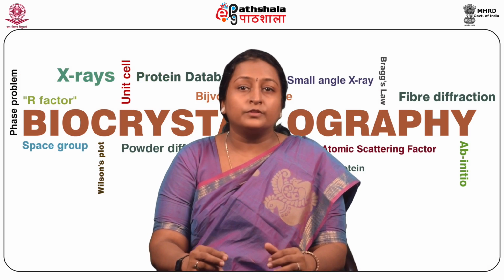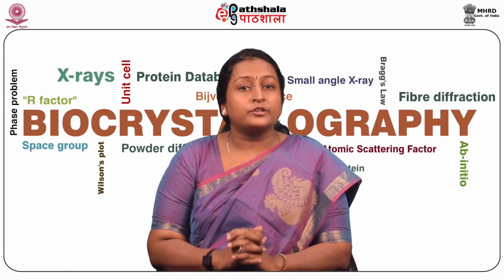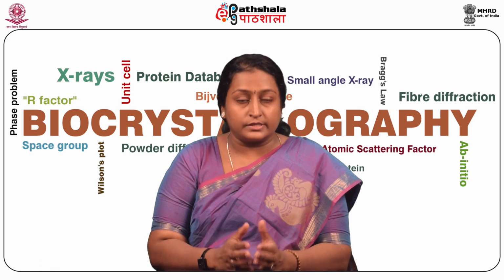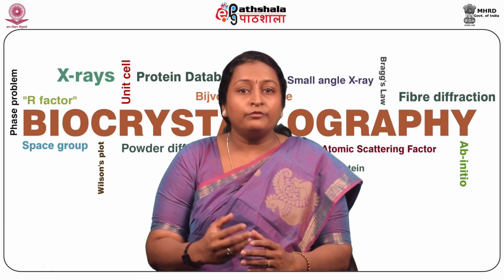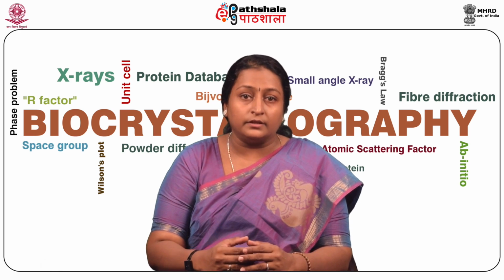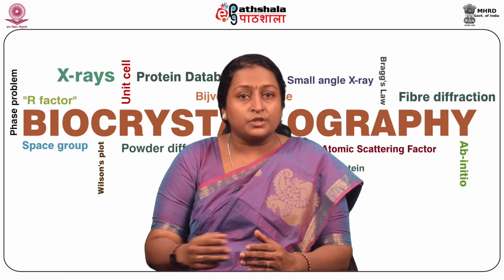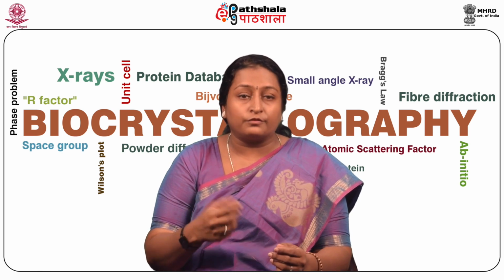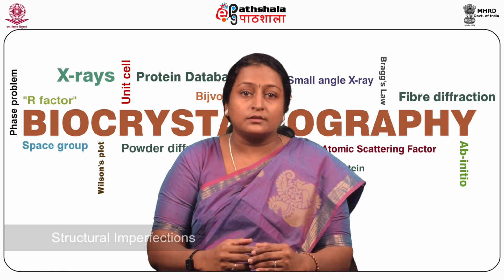Powder diffraction is one of the most important, powerful and widely used analytical techniques for characterizing materials. This technique helps in a wider investigation of physical, chemical and even mechanical properties of materials. The powder diffraction method was first devised in the year 1916 by Debye and Scherrer independently, and by Hull in the year 1917. The technique developed steadily, with traditional applications like phase identification, determination of accurate cell dimensions, and also the analysis of structural imperfections.